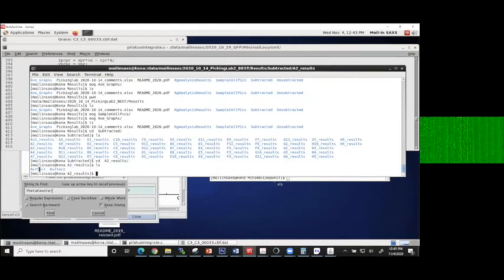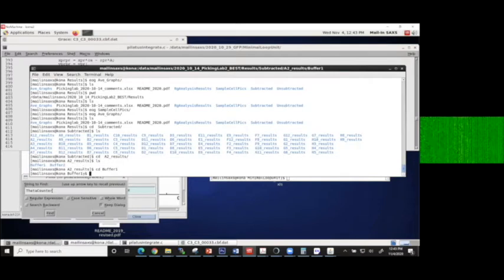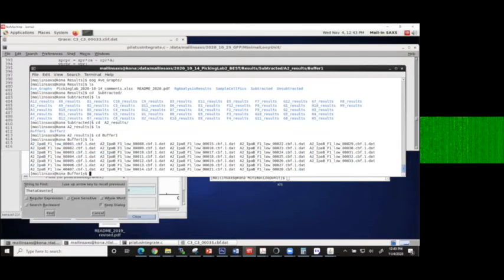This is the first buffer subtracted from your sample and the second buffer subtracted from your sample. And typically you'll have an average here, but sometimes it didn't get output in this case, but there'll be an average sometimes. All right, so each well will have buffer 1, buffer 2, and generally an average. And then if you look inside of buffer 1 and buffer 2, or buffer 1 here, you will see your subtracted data.